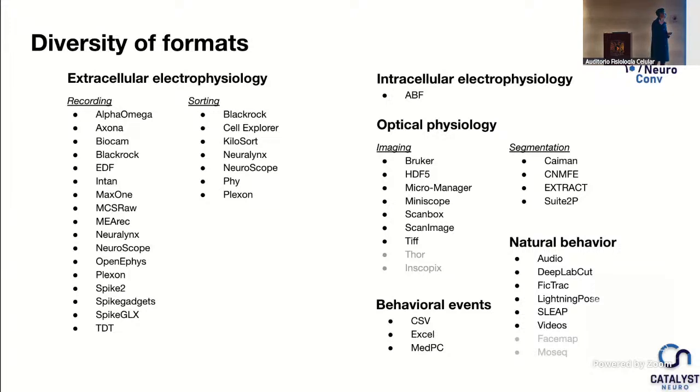We support as well ABF for intracellular electrophysiology. And we support a bunch of other formats for natural behavior like video, audio, meaning any common media containers, such as MP4, AVI, etc. So if your format is in that list, then we can make it very easy for you to do the conversion. This will be supported both in the guide and in the NeuroConv library.